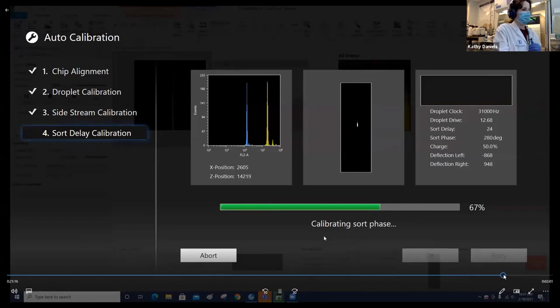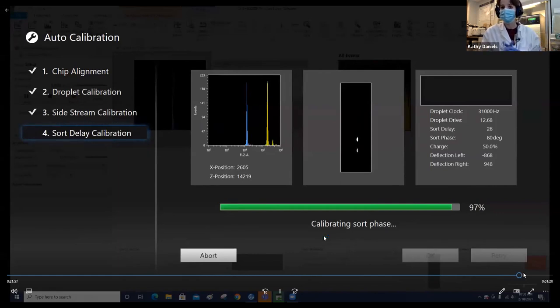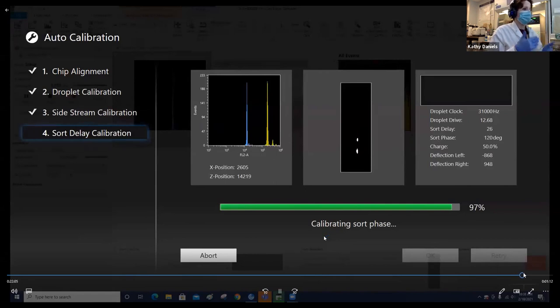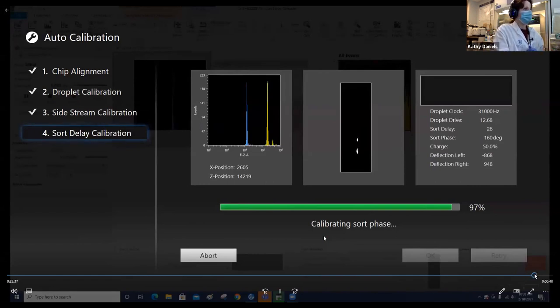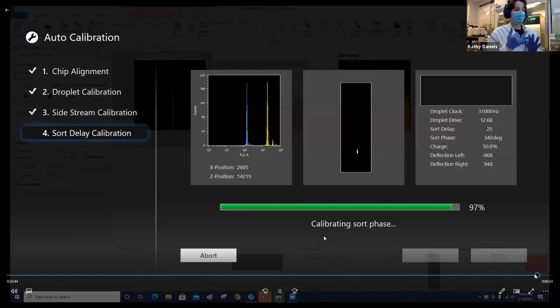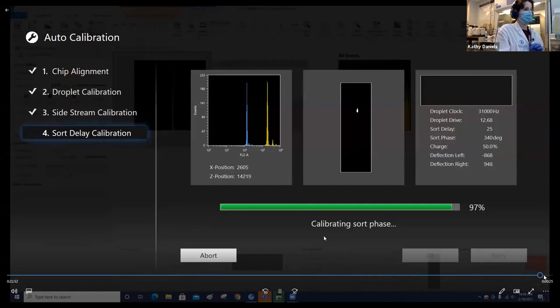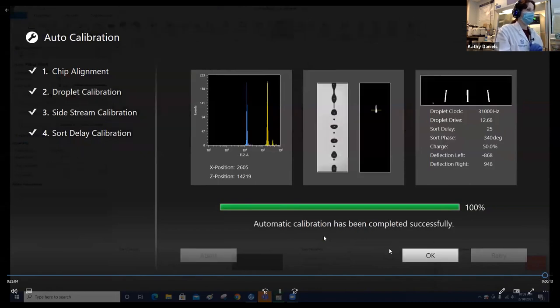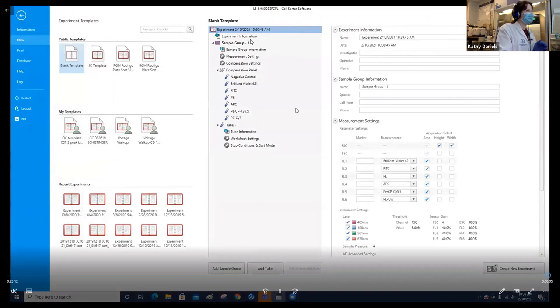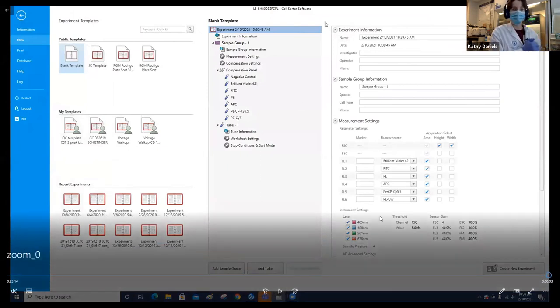The general QC time for the SH-800 is roughly about 20 minutes. Once it has completed chip alignment, droplet calibration, side stream calibration, and sort delay calibration, it will tell us that the automatic calibration has completed successfully, and at that point we can select OK and we're good to go ahead and get started with our experimental setup. Not all sorters have as automated a startup as this — many of them have some automation but quite a lot less. One nice aspect about the SH-800 is that it's somewhat 'set it and forget it' once you get the QC going.